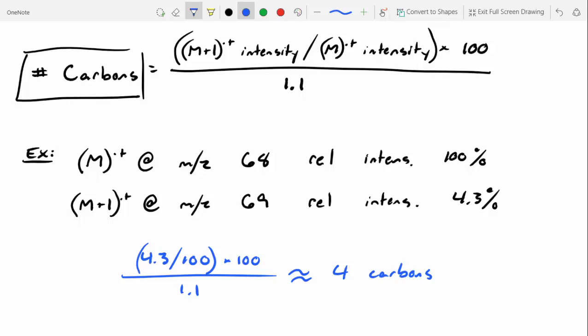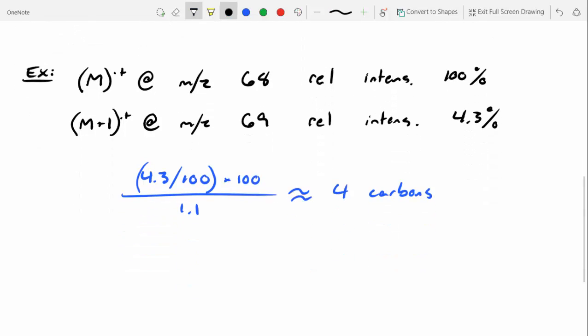Hydrogen. Yeah, probably hydrogen, because if we try to add in an oxygen, that's going to take up a huge mass. However, sometimes it does involve guessing and checking, so it may be a combination of oxygens and hydrogens. So we'll practice that here in a second. But let's do one more example.